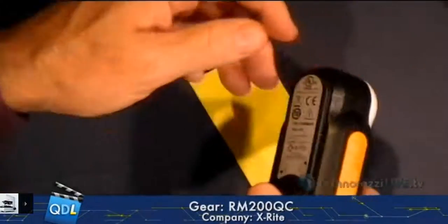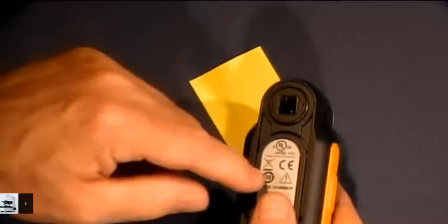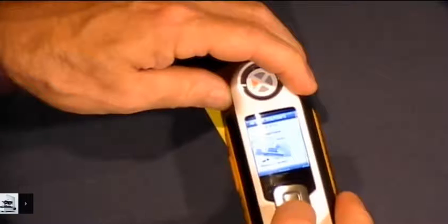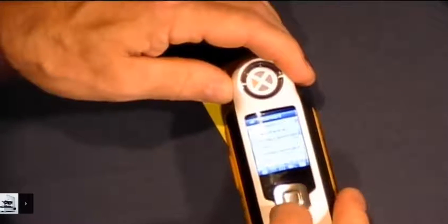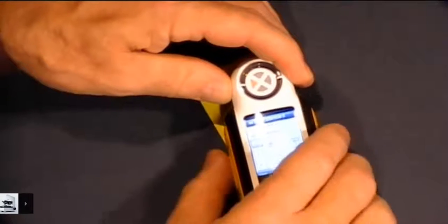Oh, and it reminded me, sorry, I was reading that. It told me that I didn't have my optics. I was still in calibration mode and my lid was still closed. So let's start from scratch then on this. Sorry about that. That's what little warning messages are all about. So we'll go back into edit mode on this. Nice little functionality there. Okay, we're ready to go.